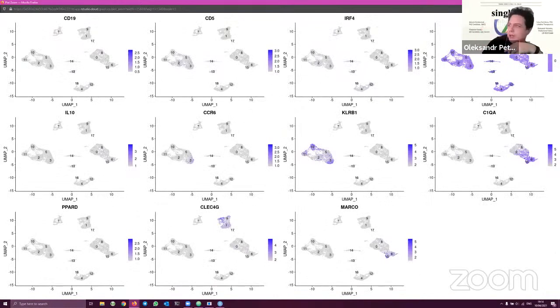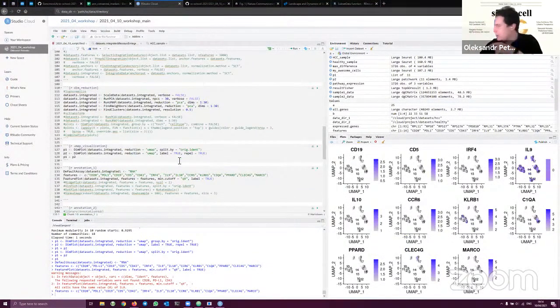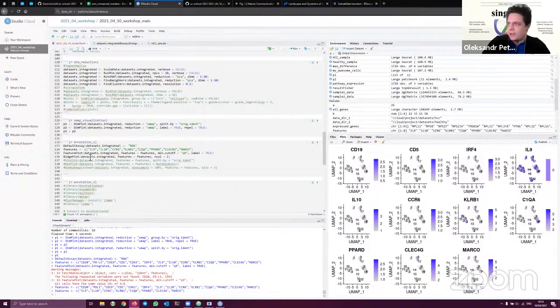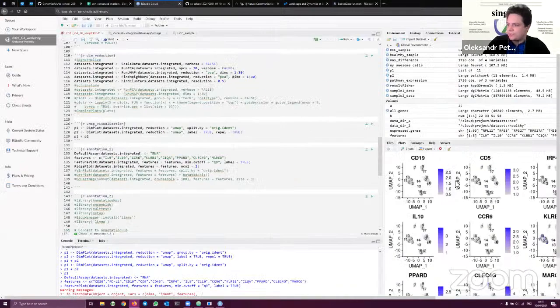And again, it's the first marker we actually do, so probably it's not the perfect markers, but still, for Kupffer cells, I'm already quite confident. And technically, if I already know what we're looking at, we can just name, okay, cluster 15 is Kupffer cells. However, now we do something more interesting. But before, we'll just make more crazy plots, because they look nice and you can see them all over the papers. They're quite standard. We will reduce the features list and make the ridge plot, so you can see how it looks.